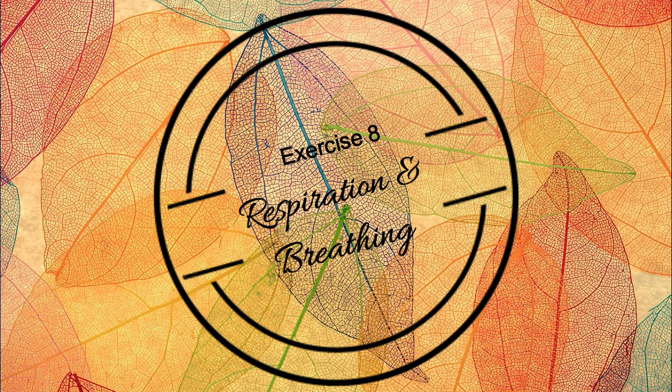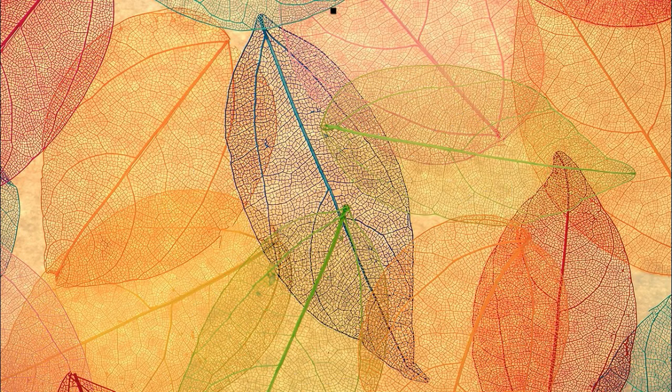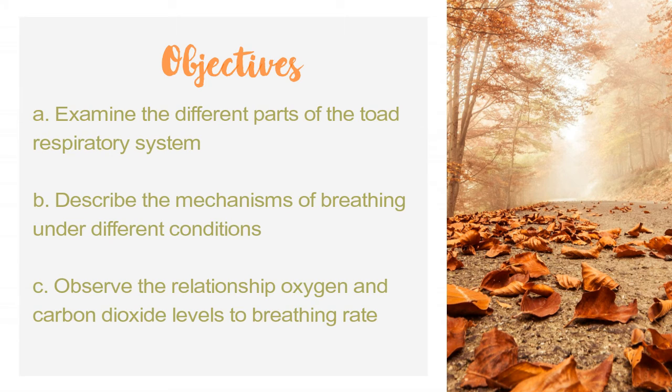Moving on to the next exercise called respiration and breathing. So our objectives are to examine the different parts of the toad's respiratory system, describe the mechanisms of breathing under different conditions, and to observe the relationship of oxygen and carbon dioxide levels to breathing rate.